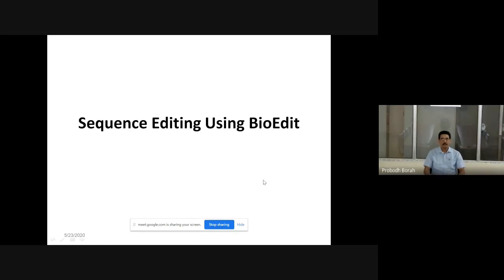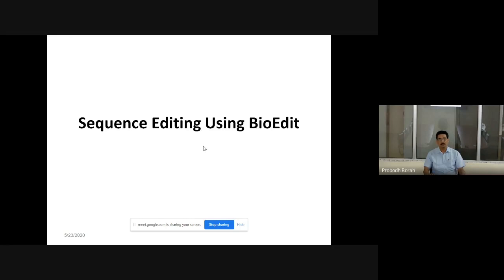Today we shall be discussing sequence editing using BioEdit software. As already demonstrated in the previous class, BioEdit is a composite software which contains many different tools for common bioinformatics exercises. It is a very useful tool for the learner. Today we shall be using BioEdit to analyze and edit raw sequences obtained from the sequencer machine.